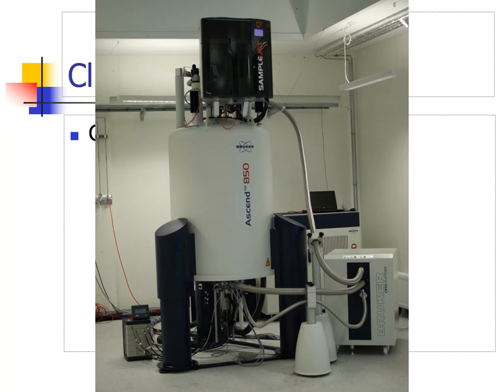Well, where it's coming from is something that looks like this. This is an NMR, a nuclear magnetic resonance instrument. And this NMR machine is just one example of many different variations and versions that might be out there. There's tons of different variants of NMR. All right, so the NMR in this picture is actually as tall as a person. So this is located in a room. You can see the drop ceiling lights and the fluorescent lighting up above it. But this instrument is massive. It is probably one of the largest instruments that we work with in a laboratory on a routine basis, if you call it a routine basis.